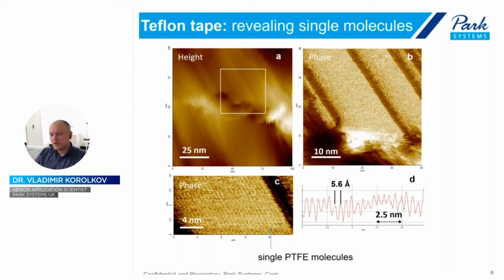And what techniques like X-ray diffraction and electron diffraction won't show you is the disordered regions. For instance, here we can see how the molecules from the highly ordered crystalline area enter another area, but they enter through that disordered region, and you can almost make out these molecules in between two lamellas. And that, again, is the beauty of atomic force microscopy. You're not limited only to crystalline areas. You can actually resolve things within the amorphous region and get a better understanding of how polymers fold and arrange themselves in amorphous areas as well.